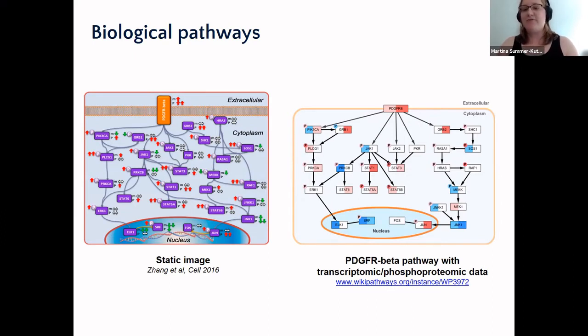So if we look at, for example, the PIK3CA in the top left, we see that the phosphorylation site is slightly upregulated. The mRNA level is slightly downregulated with a light blue color, and the protein is slightly upregulated with a light red. So we can now do this visualization automatically, and we can also load another data set immediately without redrawing the pathway figure in every single aspect.